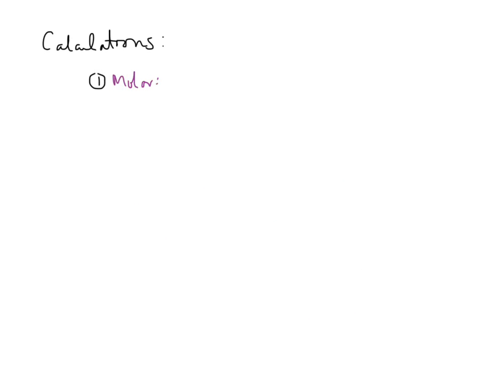So before we talk about calculations, let's talk about the nuts and bolts of getting those molar concentrations. Your instructions are to bring the three solutions you're going to need back to your workstation. You need a rack with 5 test tubes, because 1 is your known and then you have your 4 trials. That makes the 5 test tubes. So here in this one is your known. We have 2 iron concentrations, and your write-up specifically says use the strong iron 3 for your known.